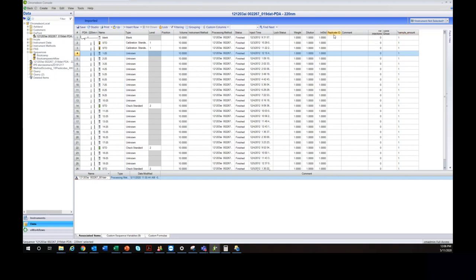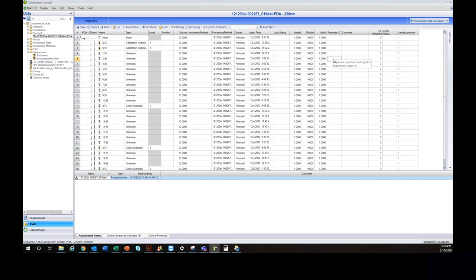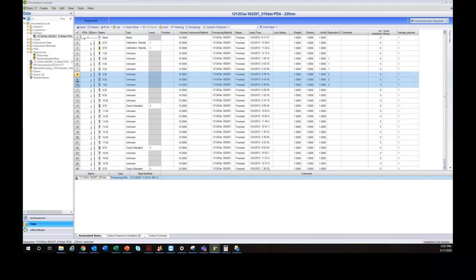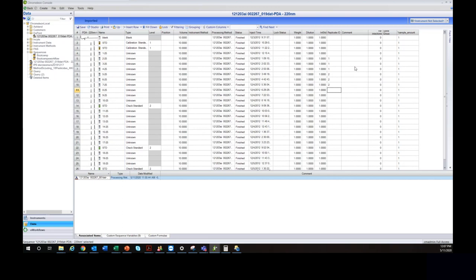The replicate ID column lets you group replicates for a summary. If you're running duplicates or triplicates and want a summary, assign the same replicate ID — numeric, alphanumeric, or alphabetic — to those injections. The comments column is used a lot for filtering in report templates: you can filter to show only samples where the comment equals a specific value. Custom variables, which we'll briefly touch on, work similarly.